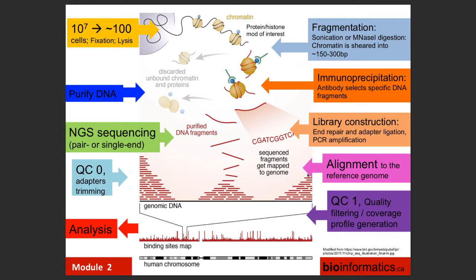So that's a summary of the process, and again, this overlaps a little bit with the previous talk. What I would like to mention here is that this step is the precipitation itself. It could be a protein, a histone, or for that matter, DNA methylation, like MeDIP. When we have antibodies to methylated CpGs, we also can do ChIP-seq-style experiments and measurements. It's actually a very interesting assay.